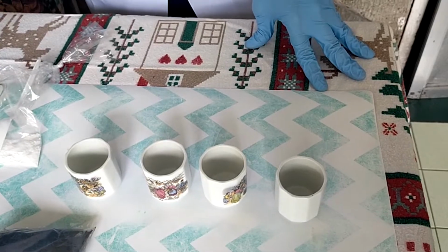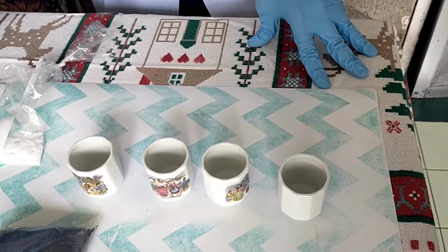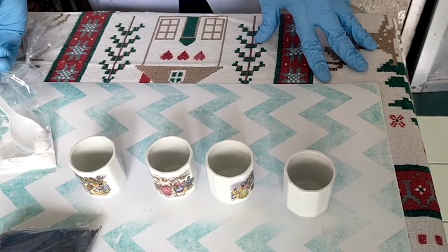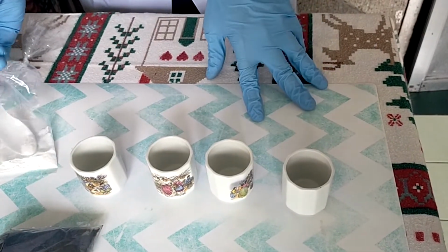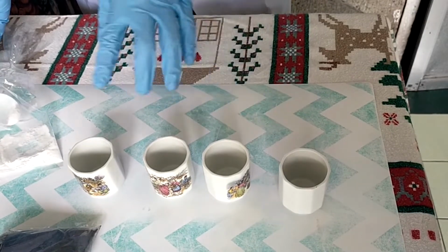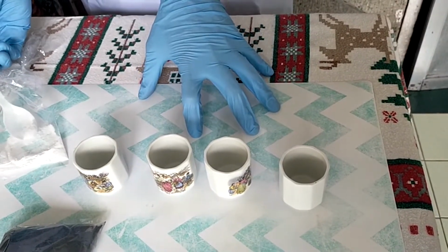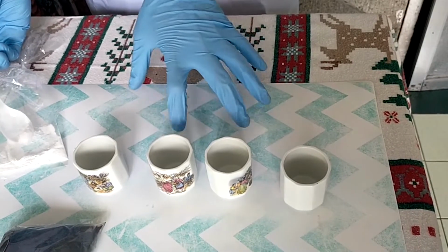Okay, now this time I will be performing a solubility test. So the excess of the crushed naphthalene I will put into each of these makeshift containers, and then I will add drops of solvents.